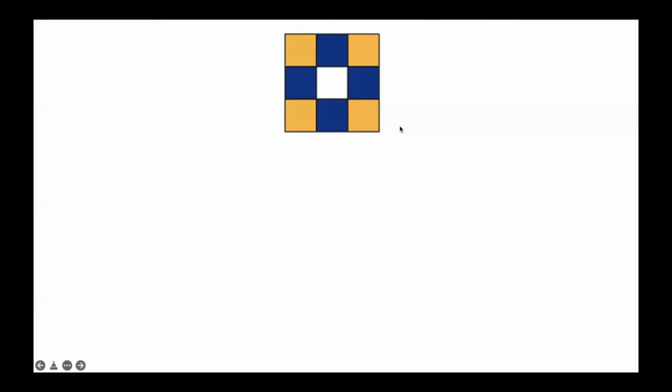If you check the box in the CiliaQ settings, then CiliaQ will connect a voxel, like this white square, if we imagine it as one voxel, to all the direct adjacent voxels, which are the blue ones, and all the diagonally adjacent voxels, which are the orangish squares in this picture. All of these will be connected to our voxel to form a cilium object.